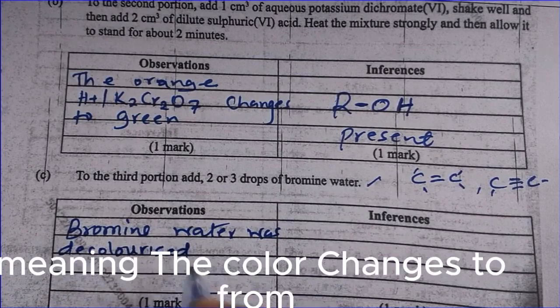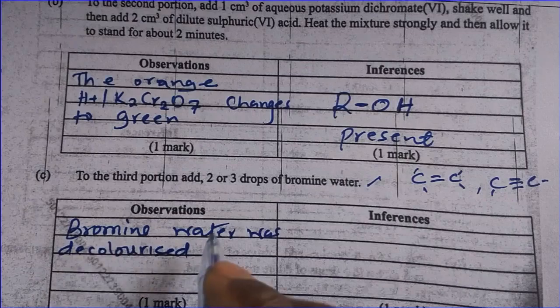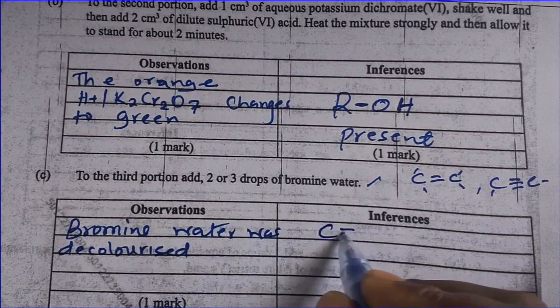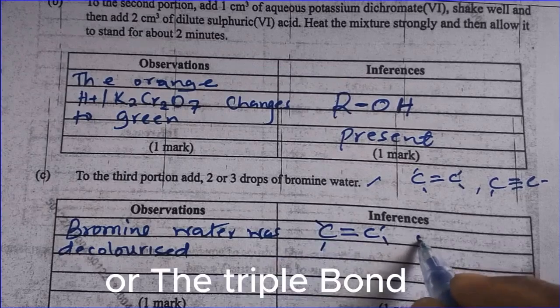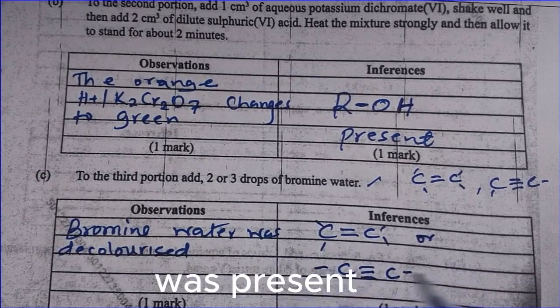To decolorize means the color changes from the original color to colorless. So this means that the double bond or the triple bond was present.